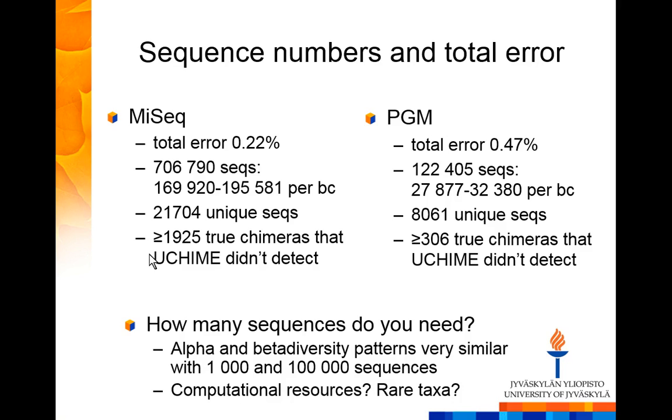The amount of unique sequences is huge, for both of the techniques. It actually seems to scale up with the number of sequences. So I think the amount of templates, well, it was 8 different bacterial species, and some of them had different 16S copies. So I think the total number of different templates was 10 or 11. But still, this is the amount of unique sequences that you get. Lots.